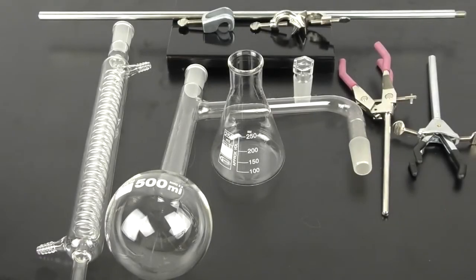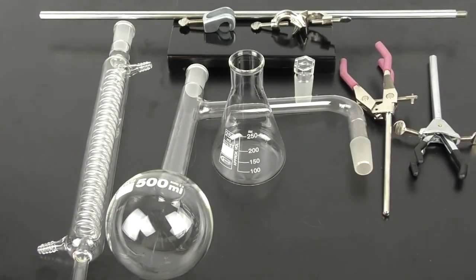The distillation apparatus contains all the required glassware and support materials for performing simple distillation experiments.